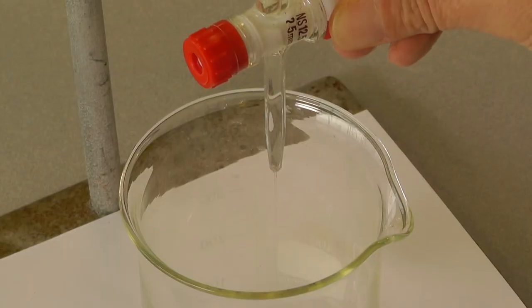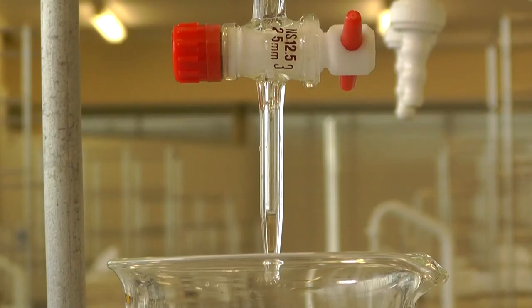Check the jet for air bubbles. These can be removed by opening and closing the tap.